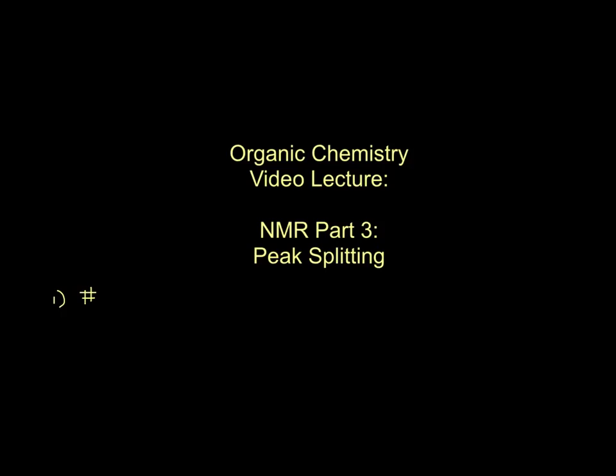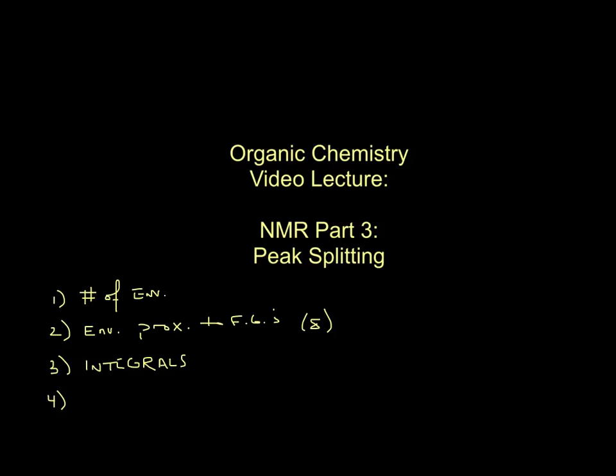One is the number of hydrogen environments. Number two is roughly what those environments look like, that is to say, kind of those environments' proximity to functional groups. We wrote that as the chemical shift. And the third thing was the integrals, which was how many hydrogens are in each environment. The fourth thing, which is peak splitting, tells us about the neighboring hydrogens, and that's what we're going to be talking about today.